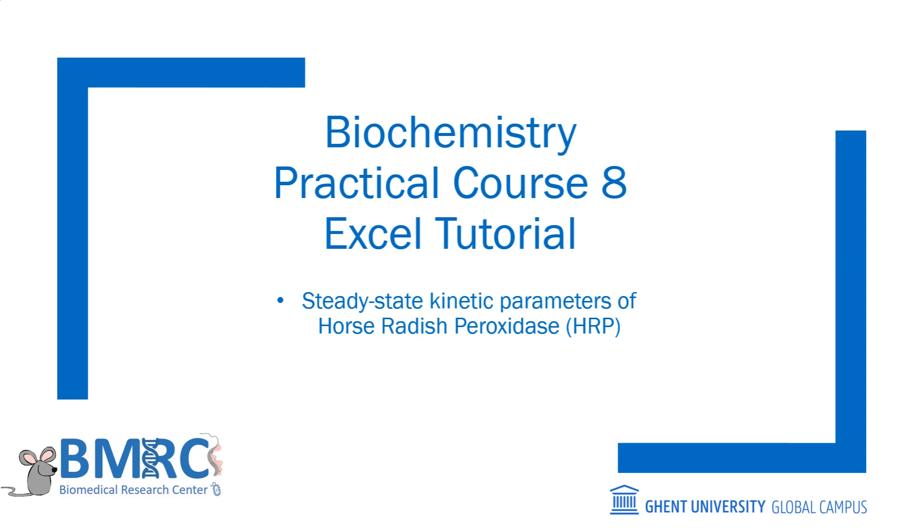Welcome to this Enzyme Kinetics Excel calculation tutorial. In this video, I will guide you through the steps to calculate enzyme kinetics parameters by plotting the Michaelis-Menten and Lineweaver-Burk plots. Please read the protocol before watching this video so that you can follow along. Now let's get started.